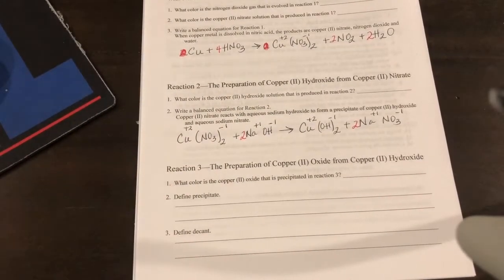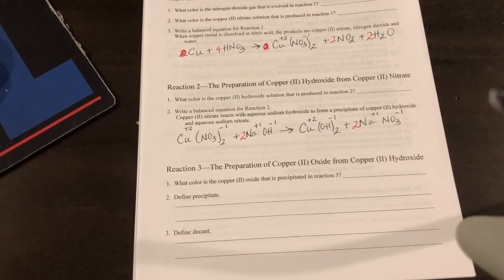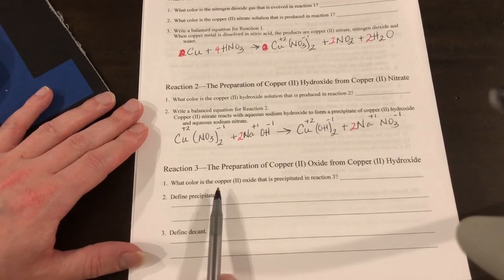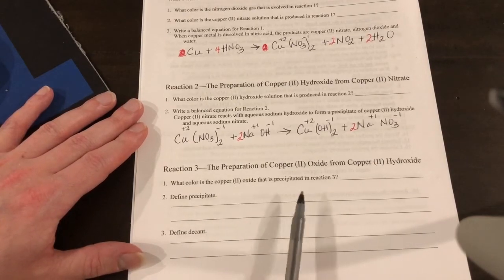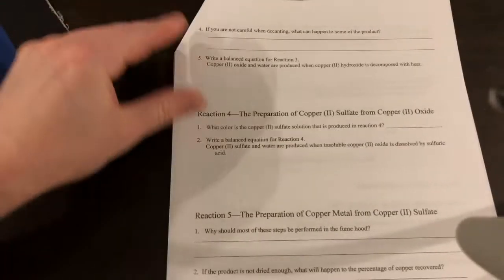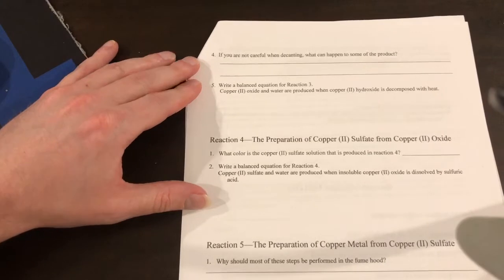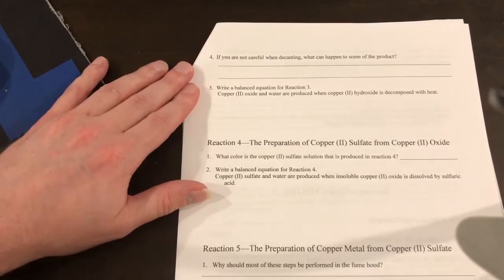Okay, after watching reaction number 3, we should be able to define these terms right here, precipitate and decant, and we should also be able to note the color of the copper 2 oxide that's formed. If you're not careful when decanting, what can happen to some of the product? Well, you go down the drain.